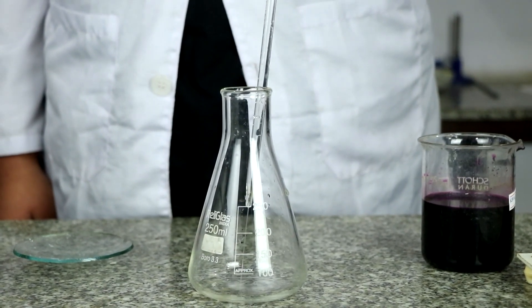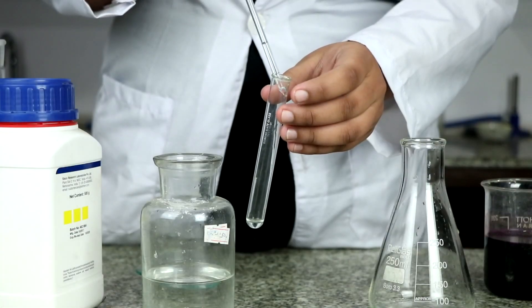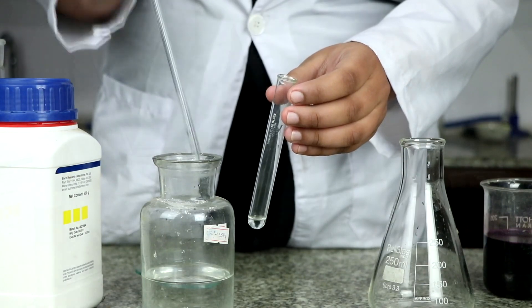Then add one test tube full of dilute H2SO4 to the required solution to prevent the hydrolysis of KMnO4.